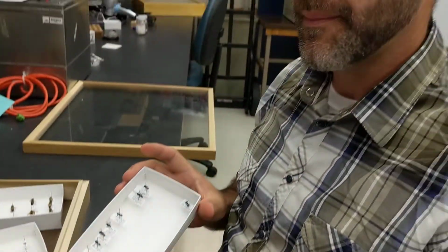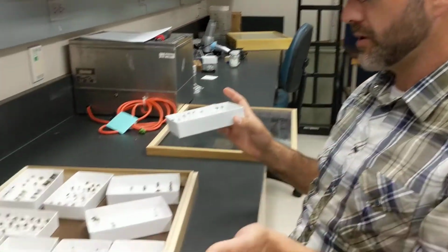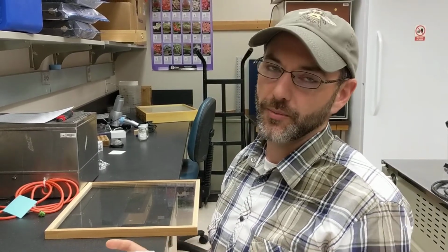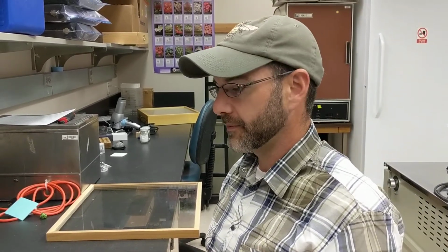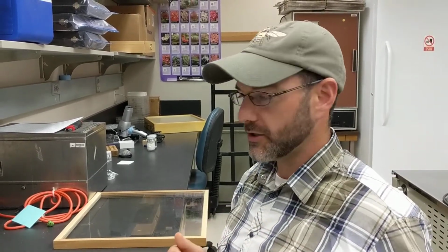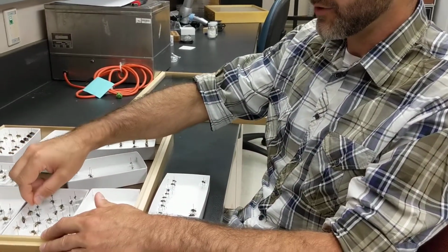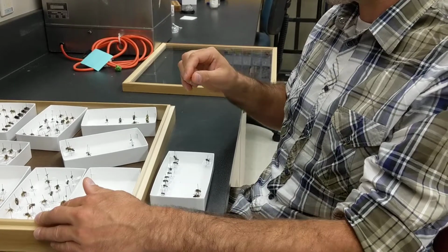It also depends on how much material you have. Here we have 125 specimens, but if you're at home and you have 5,000 specimens, the process will be a bit different. You probably want to start as finely as you can, so you pull out maybe all the bumblebees out of all of your pinned and labeled material and just work on your bumblebees first, and then you could pull out a tribe, or depending on how much experience and skill you have, whatever kind of group you're able to recognize, and then work through those.